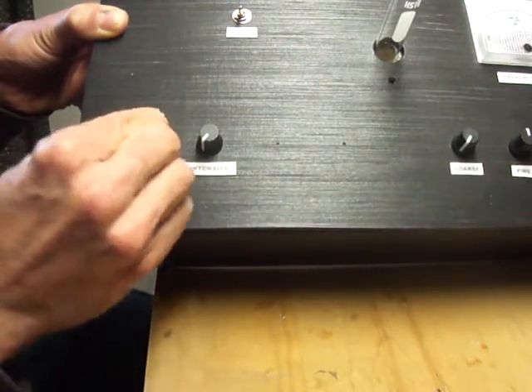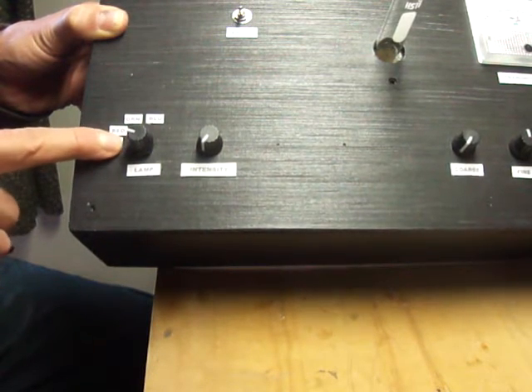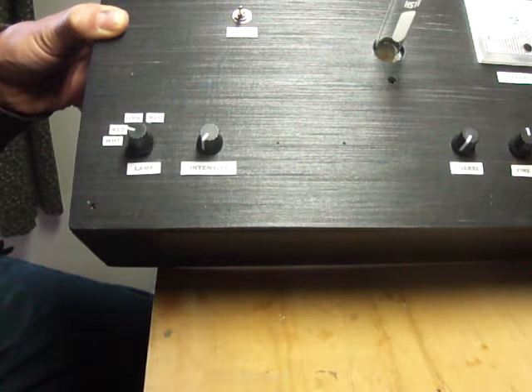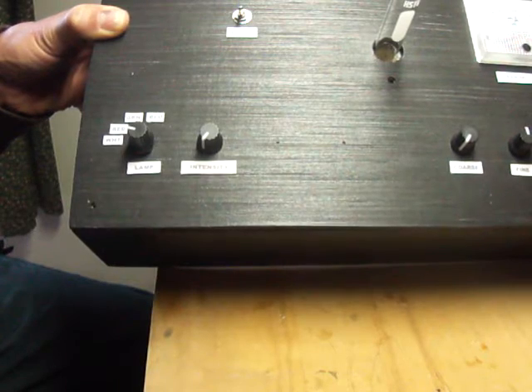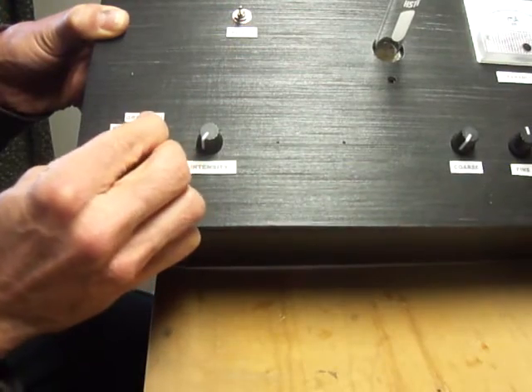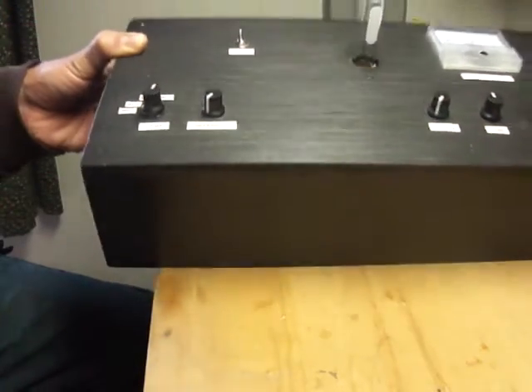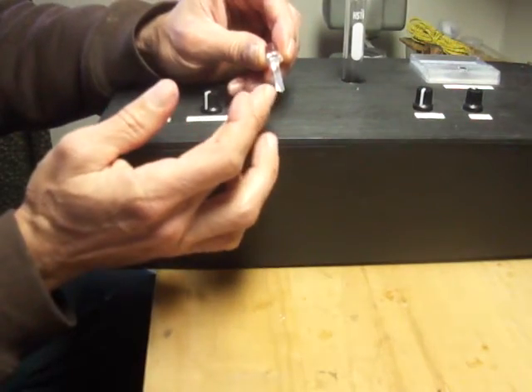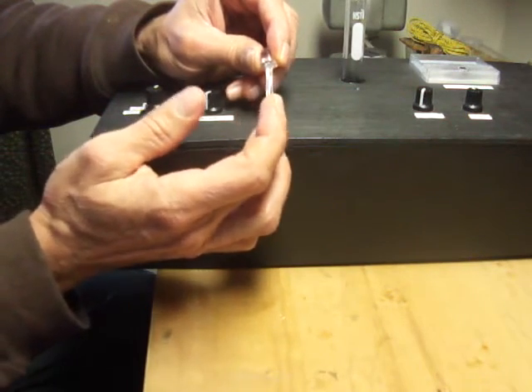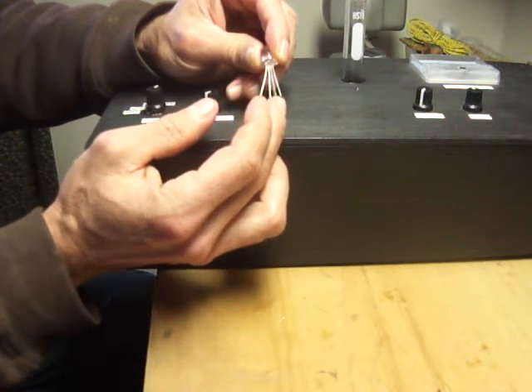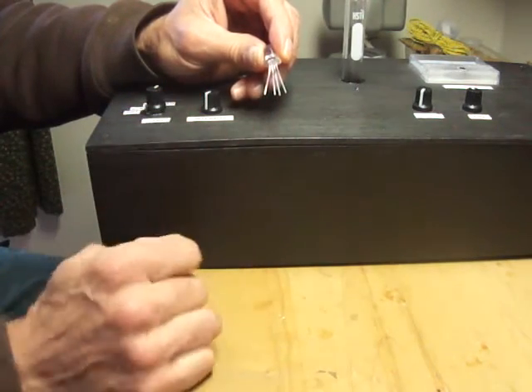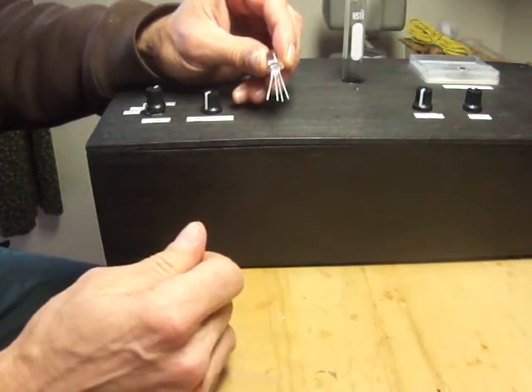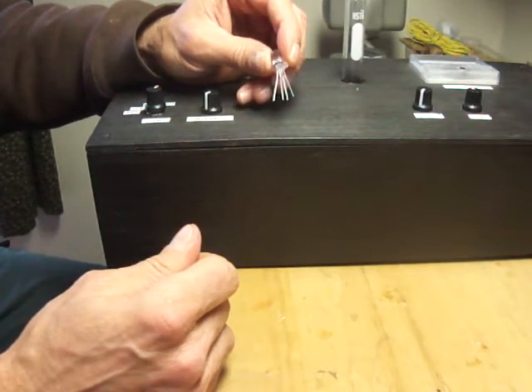What I have is a white light, which is from a plain white LED, and that would be helpful if you have a dark type solution or if you're measuring turbidity. There's also red, green and blue options, and I got those with a tri-color LED. The long leg here is for the common and each of the other legs are for each of the colors. I was hoping to power all of them at once and come up with a white LED, but it doesn't work that way, so I put in a separate white LED.